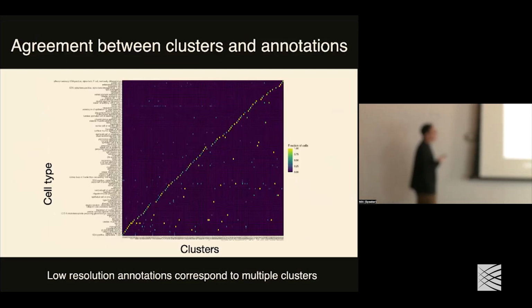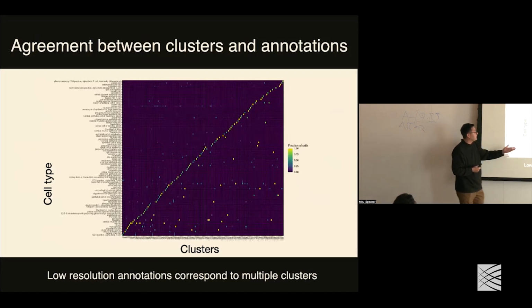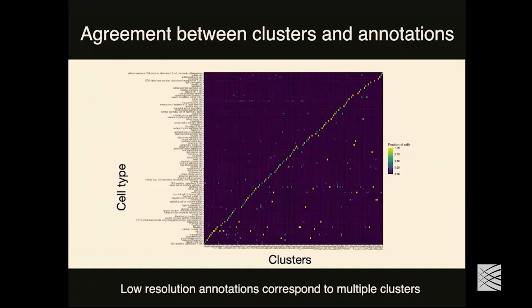Then we can compare our clusters with their stored cell type information. Generally, we get a good agreement there. And at some low resolutions, for example, here they indicate neurons, that one corresponds to multiple clusters. So the point is that you can see the sketch integration method maintains the cellular signal in the original data. And right now, we haven't reached our limit there.